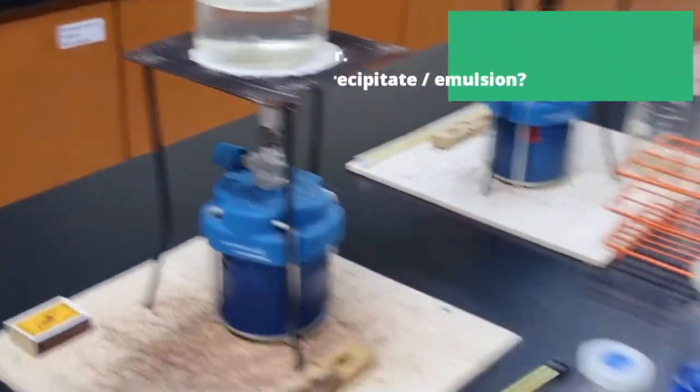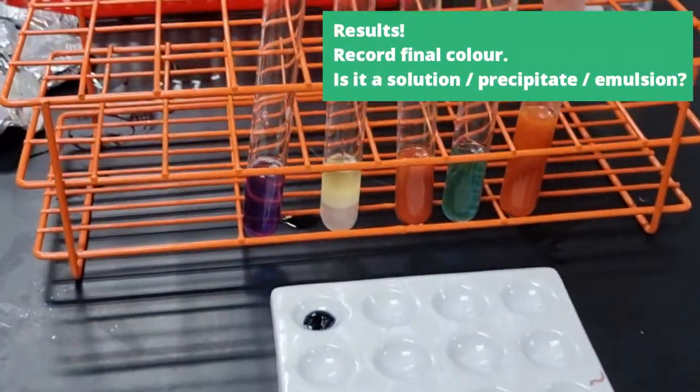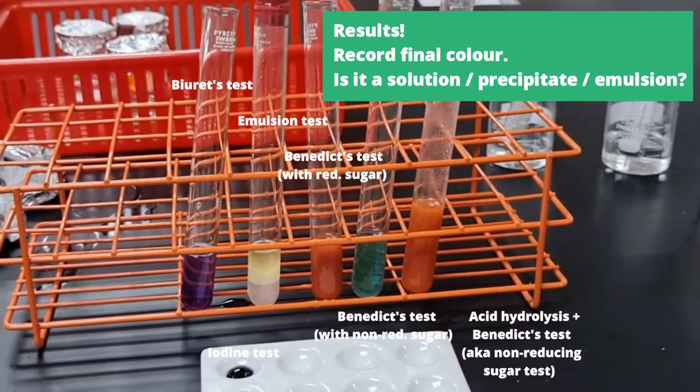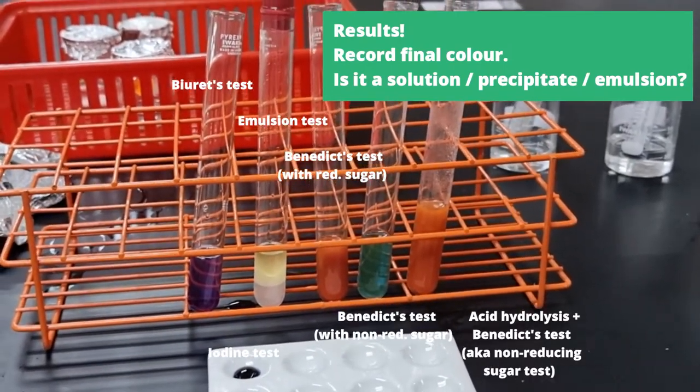And with that, we are done with all our biological tests. When you record results, make sure you record the final color and record whether it's a solution, precipitate, or emulsion that forms.